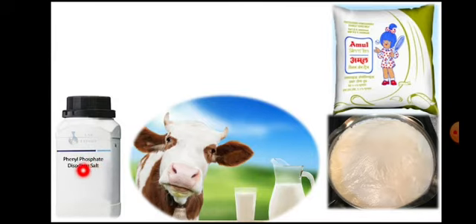Then next is the substrate for phosphatase, that is disodium phenyl phosphate. It can be called phenyl phosphate disodium salt. So this chemical is useful for the preparation of a solution called buffered substrate. As it is related to enzyme, this chemical is prepared in buffer, and therefore it is called buffered substrate.